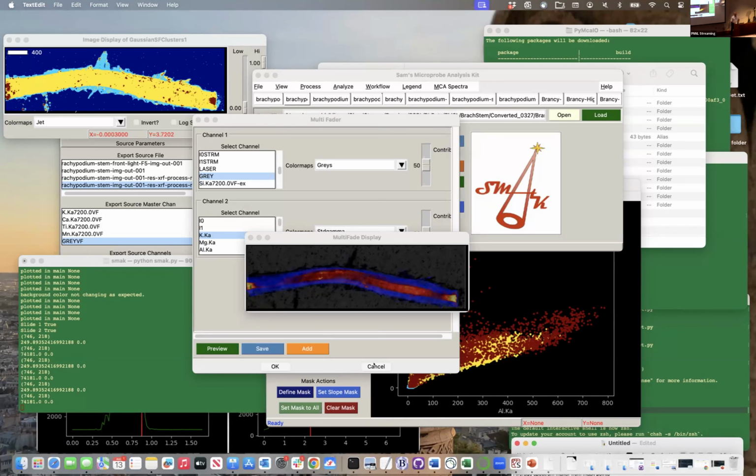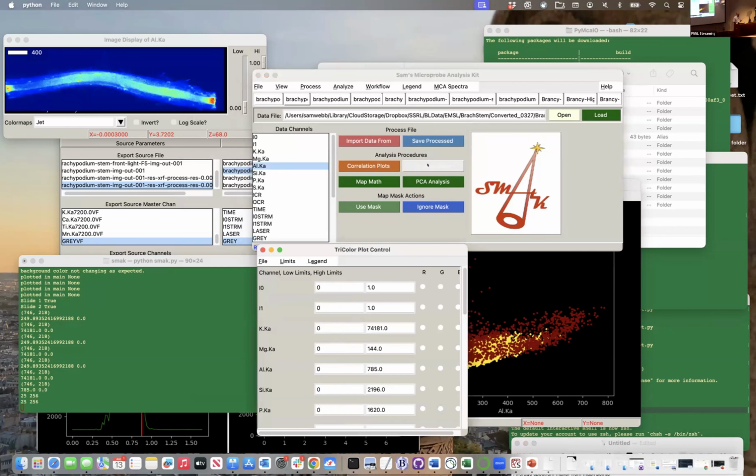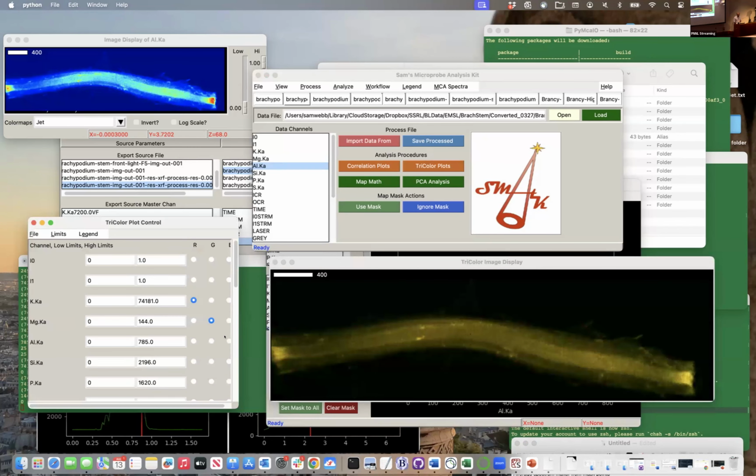Thank you. Well, not for me, for people that have color vision deficiency. And I will say, this is also another point for, as much as I do love Jet, it's very biased. And a lot of the other color schemes like RGB, everyone loves these RGB color maps because they are easy to do, right? But people who don't see those, well, that's not a very good one to do. Get something that has something, yeah.